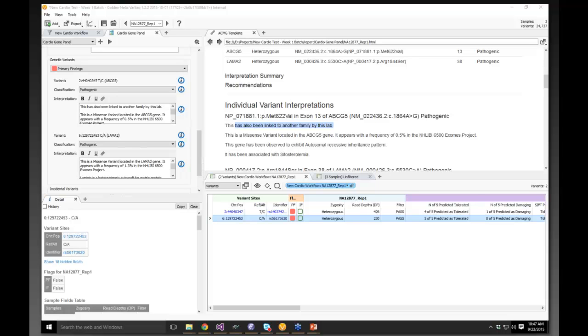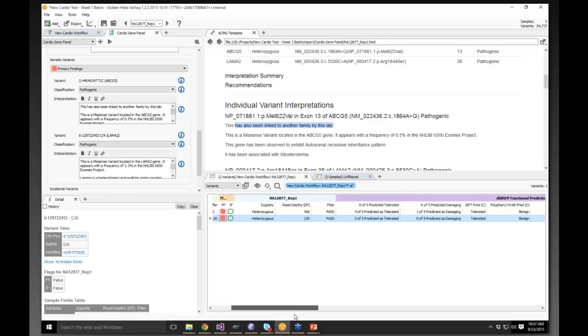So things like these functional predictions from dbNSFP are updated as soon as they release a new version. They often are changing things, and we have to keep up with those changes, and then we curate those for you and put them in a very usable package, and do things like put these ranking or voting algorithms in front of these scores to help usefully assimilate that data.